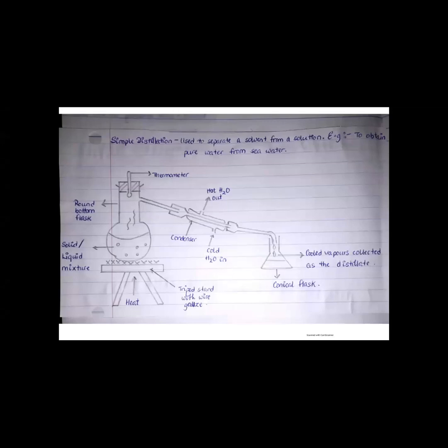All right, so now at this point, we're going to look at simple distillation. Simple distillation and fractional distillation are two separation techniques that always come back in your paper too. So let's move on to that slide. Let me explain it, and then I'll show you an experiment based on such. So we have here our setup for simple distillation.